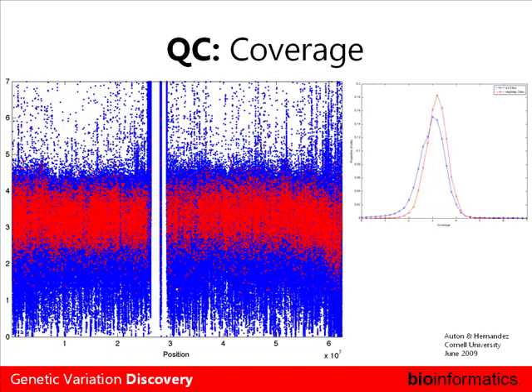The easy part of the 1,000 Genomes Project has been aligning things and doing the SNP calls. Now what they're facing is, how do we know these are right? For any particular individual, they're calling around 4 million SNPs, and it's unlikely that you're going to use any assay to try and validate even a good portion of those.